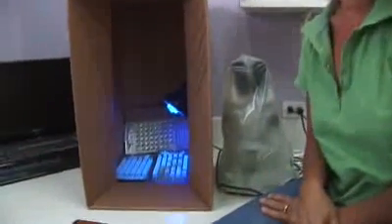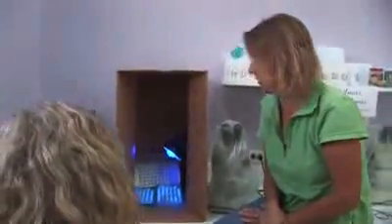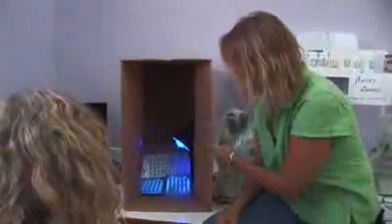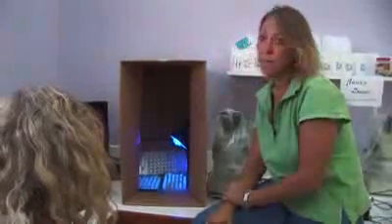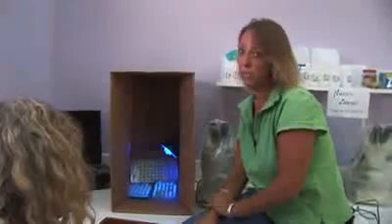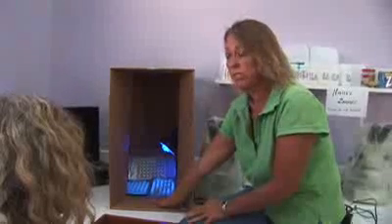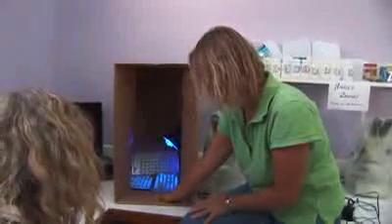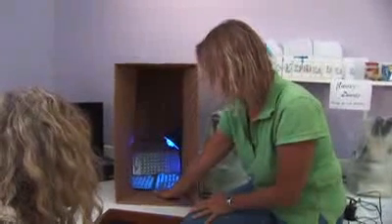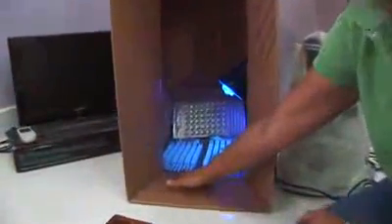Well, I was expecting that maybe there would be less bacteria further away from the ditches, but in fact what we see here is more bacteria in the well further away. The panel in the back is from our drinking water, and I ran that as a negative control. You can see that there's no cells glowing, there's no contamination in the drinking water here at the lab. This is the well that was closest to the ditches, and it's got a similar level to what we saw the other day. This is the one further away, and it's much higher.